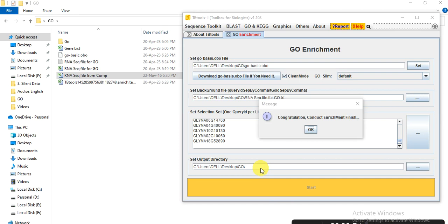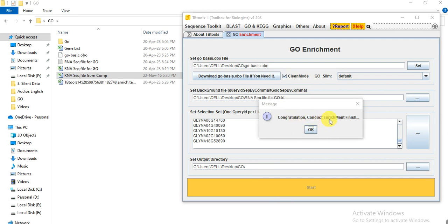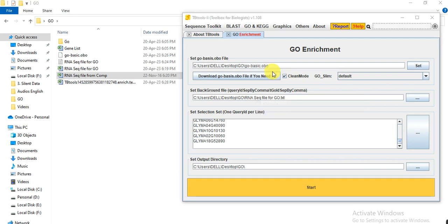The analysis will complete in about one minute maximum. When the message 'Congratulations, GO enrichment finished' appears, click OK.